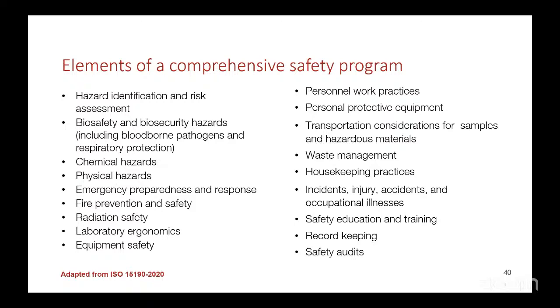Preparedness. Talking about emergency preparedness and response means when there's an emergency, it could be an emergency within the hospital, within the lab, or a global emergency. How do you prepare? What is your plan? What will be your response? What are the contingency plans? What are the safety measures?